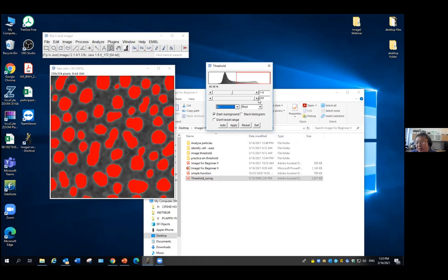If I have an experiment that lasts 4 or 5 months, even at the same microscope using exactly the same settings, during this time the microscope may change. You may change to a new laser or a new detector, so the sensitivity changes. Also, you cannot really control your control sample and experiment condition through the staining process, so they may not have the same background level.